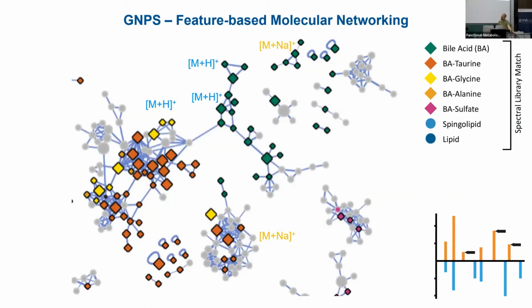So, and then those are more abundant than the M+H that everyone is looking for, right? So you could get to some wrong conclusions just looking at one ion. So it's always nice if you can find more. But perhaps the same applies as with the feature finding yesterday. These are pretty fancy tools, but they're not showing you absolute truths. That's just one way of looking at the data, and it's full of caveats and perhaps artifacts. So you, as the experts, are needed to be critical about what you find.